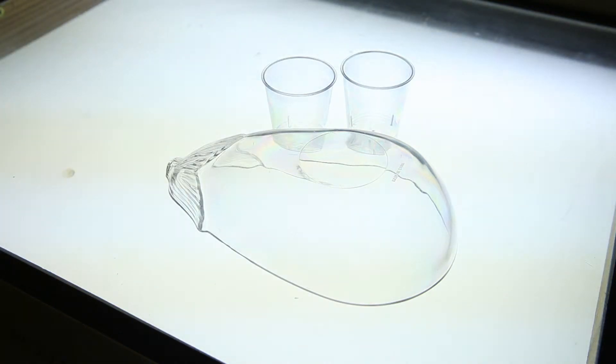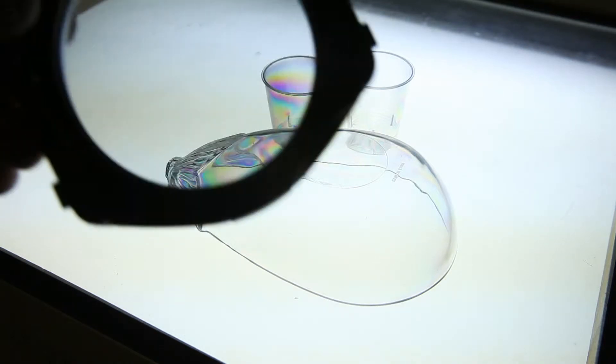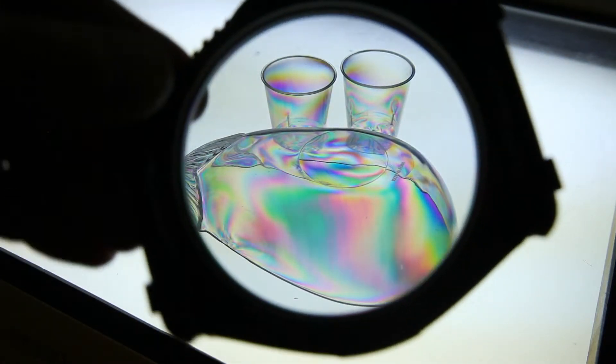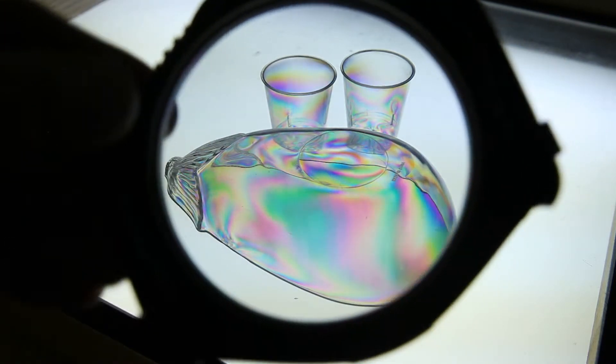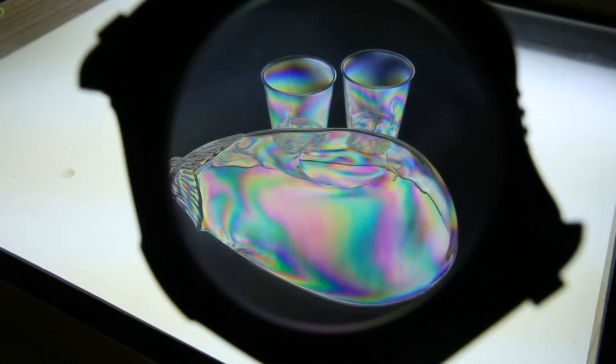I'm now going to put a polarising filter in front of the lens, and you can see immediately that the biofringence, the colours, show up in the material.